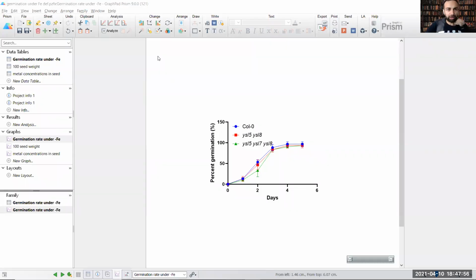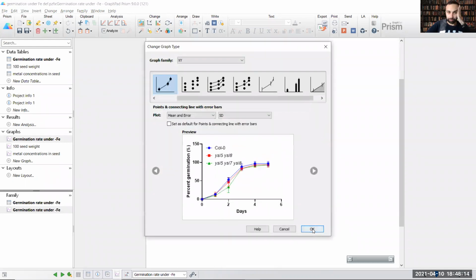It has been a while, I haven't worked on it, so I forgot many things. But for example, you can change the graph very easily by just pushing here. In my case, it's a bit slow. I don't know why. Maybe it's because it's cracked. I don't know.